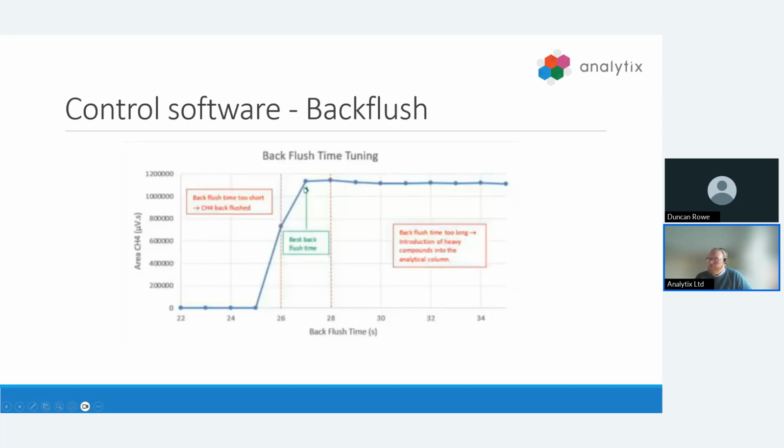So at this point, anything that comes in is going to be a heavier eluting compound. This is the perfect point to apply backflush. That then sends the rest of the sample in our sample loop out to vent, and all we're seeing in the system is our peak for methane. This is great for shortening run times, as well as removing any interference from the next run in our sample portion.